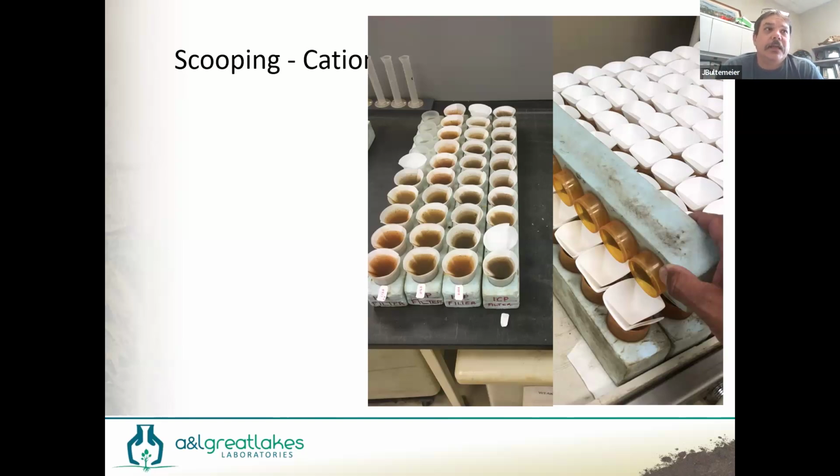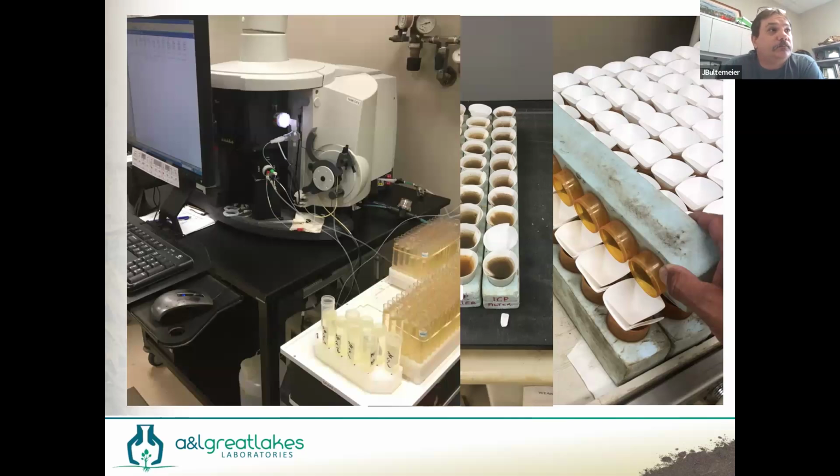Same with these nutrients. If we don't have a relative reference to work with, the number really doesn't mean anything. 12 units of measurement. Is it a centimeter? Is it a foot? Is it an inch? It's irrelevant unless we know the rest of those details. And keep that thought in mind as we continue on this conversation, this journey.